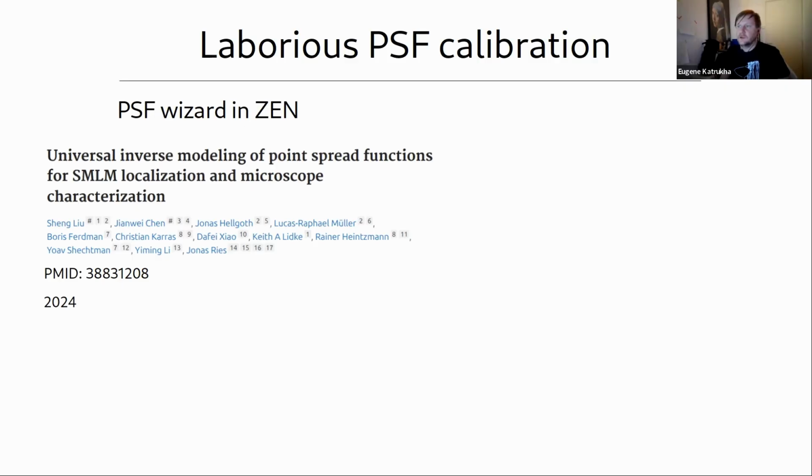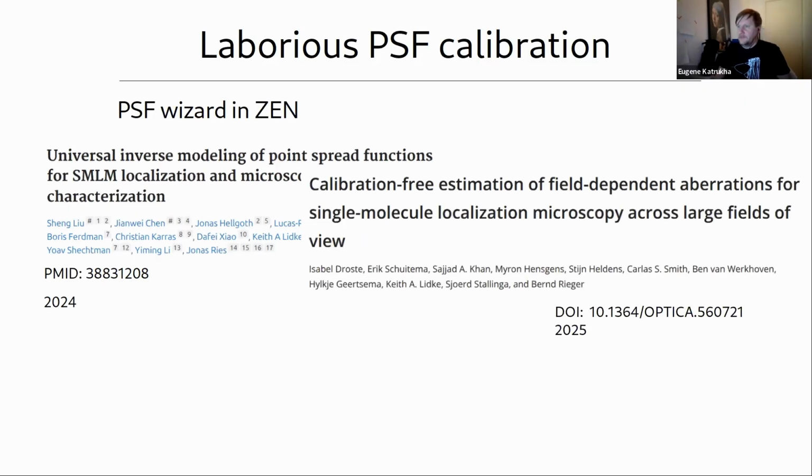I think they used TensorFlow to rebuild all the things. And of course, all these papers also take into account that the point spread function cannot take any arbitrary shape. There is a very good theory behind it. So you can use Zernike polynomials, and your number of actual parameters reduces pretty efficiently. Then all these brute force optimization systems can really give you a really good solution.